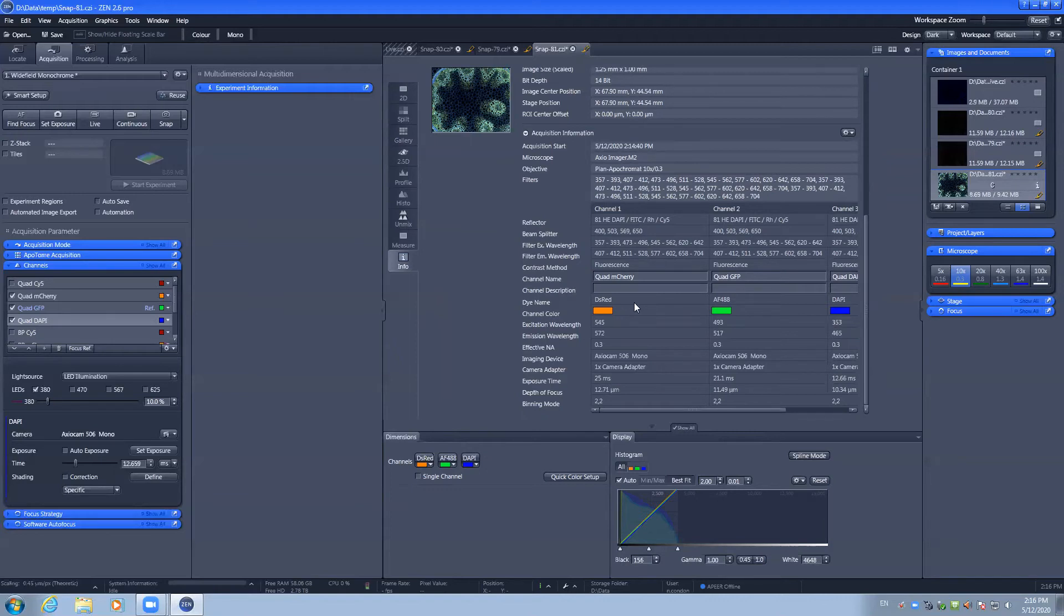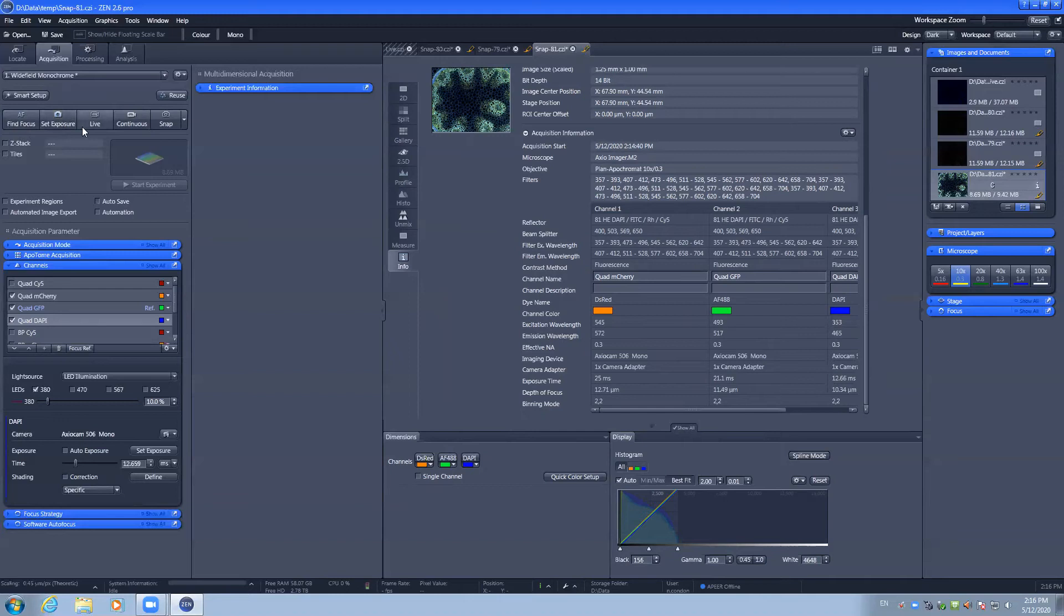So you can quickly take a 2D multi-channel image by performing a fine focus, a set exposure and a snap.